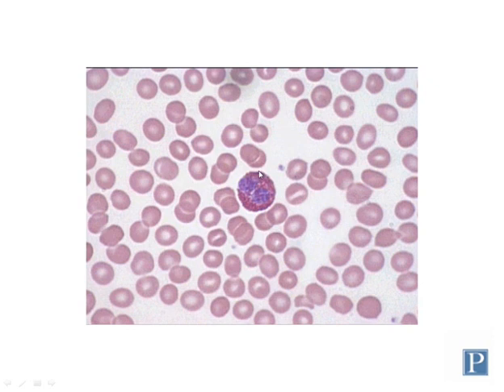These are the second most rare types of leukocytes overall, so you really have to hunt to find these, but I know not every slide will necessarily have them, but some of the slides in lab always do have them. So if you can't find one on your slide, try to look at a neighbor's, and if you do find an eosinophil, be sure to share it with the class so that other students have an opportunity to see it firsthand through the microscope.